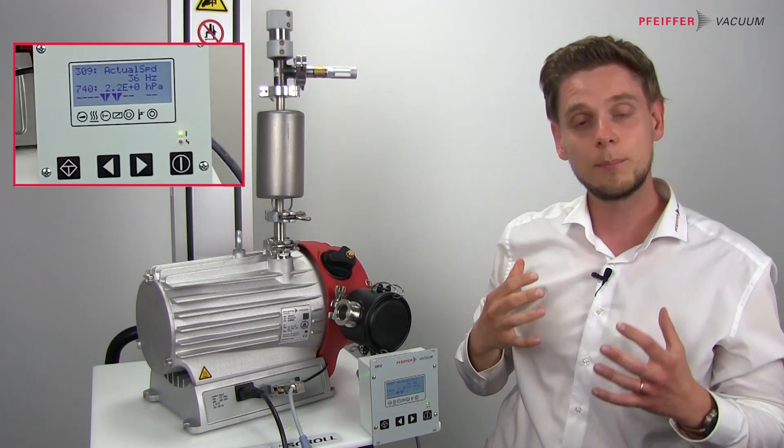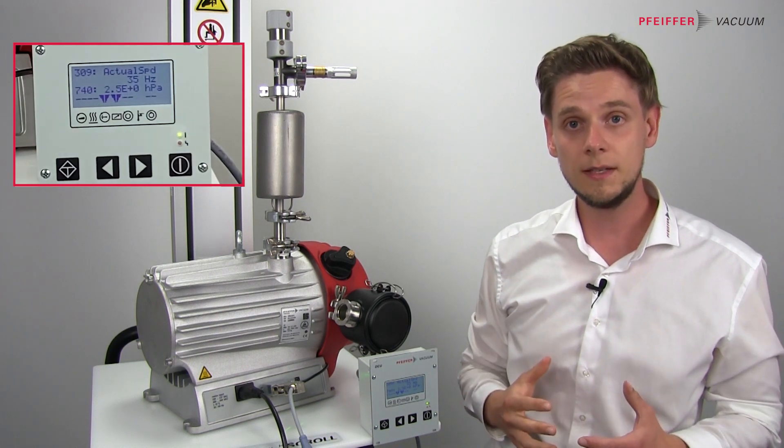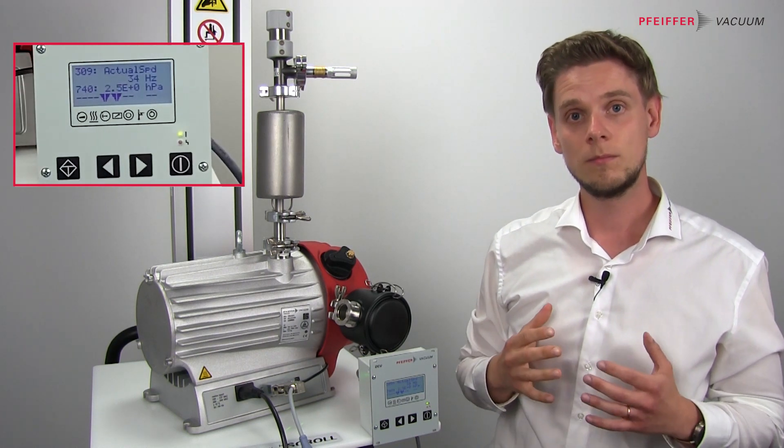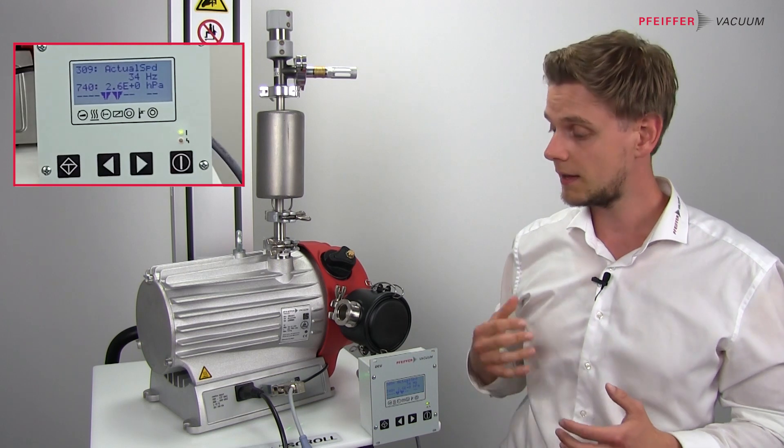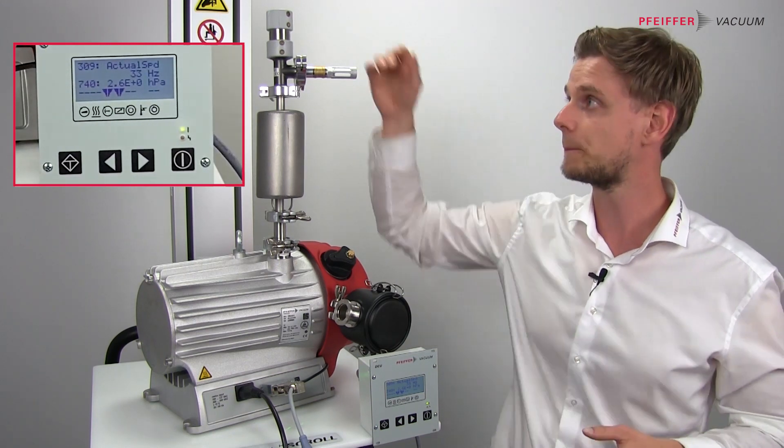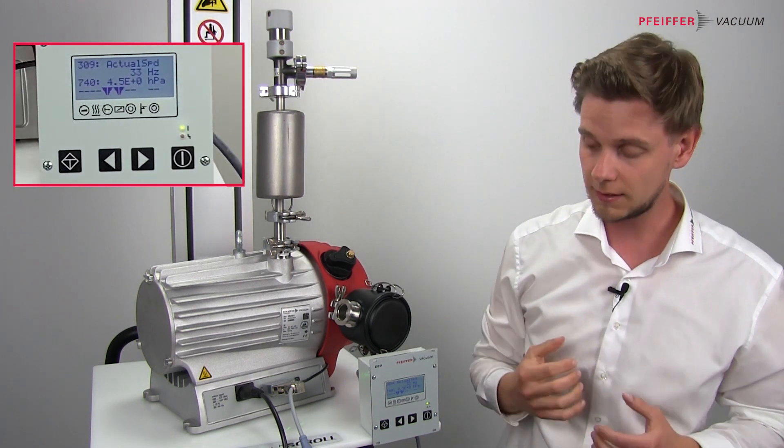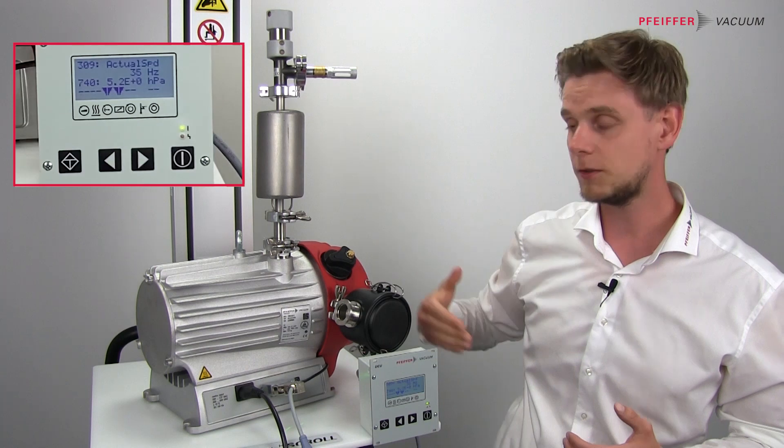And if the pressure is reached, the pump automatically continuously monitors the gas load and tries to fix the speed to that one you need. As you can see here, if I increase the gas load, the pump speeds up again.